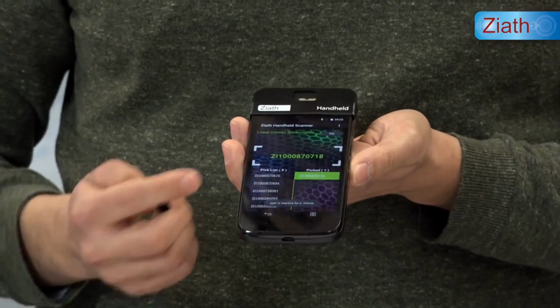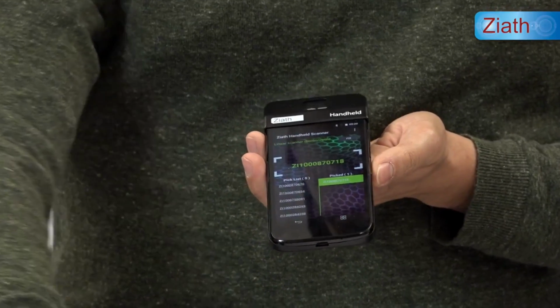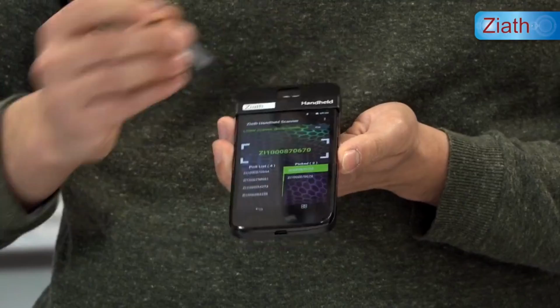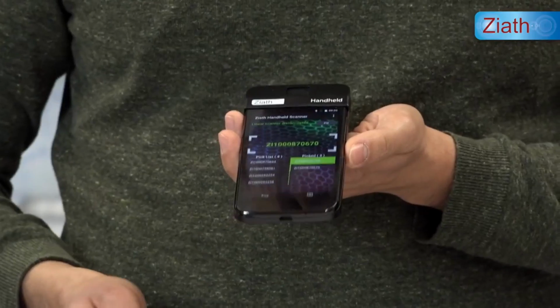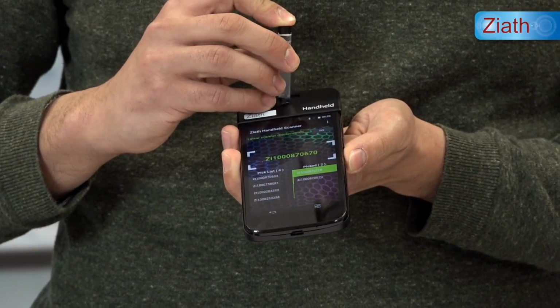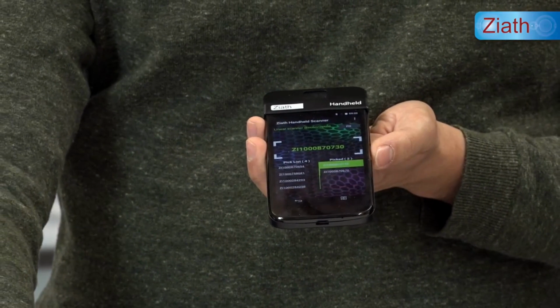The tube will scan and move from the left-hand side to the right to show that it's been picked. If I do the same again for a second tube, it will also move that tube to show that it's been picked. If a tube is not contained in the list that needs to be collected, it will show you an error on screen informing you that tube was not contained in the pick list.